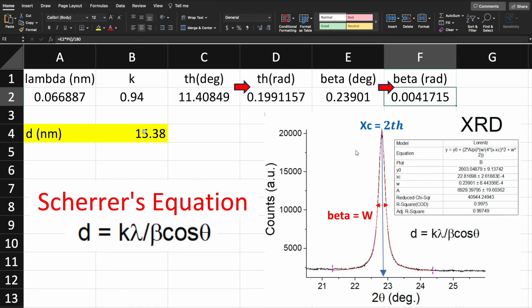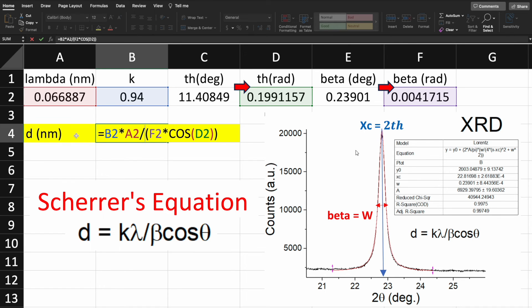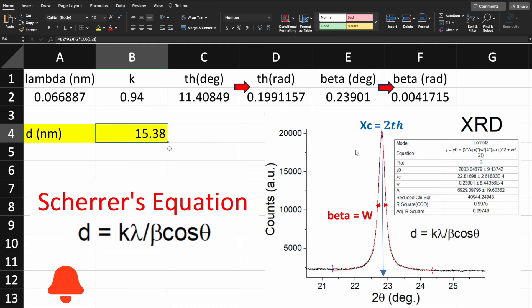Now we have to write down the formula, that is the Scherrer equation, which is d equals k times lambda divided by, in brackets, beta times cos theta. Enter, and the grain size is 15.38 nanometers. I hope through this video you learned how to calculate grain size.